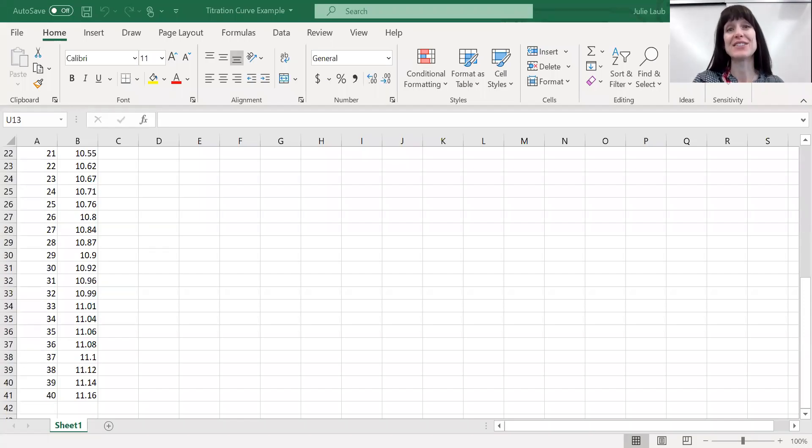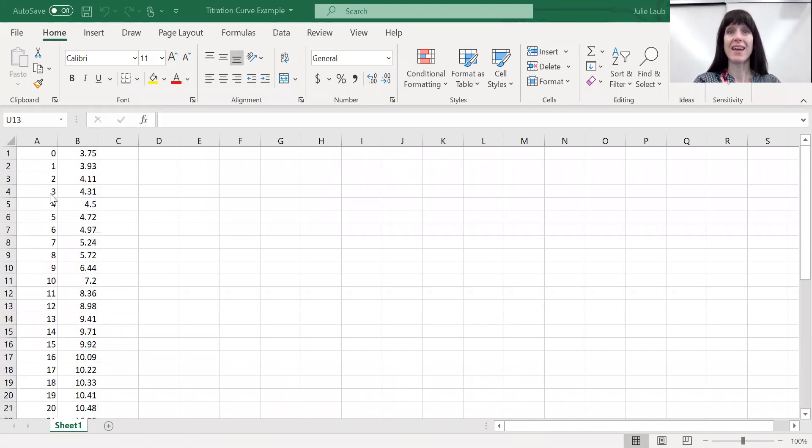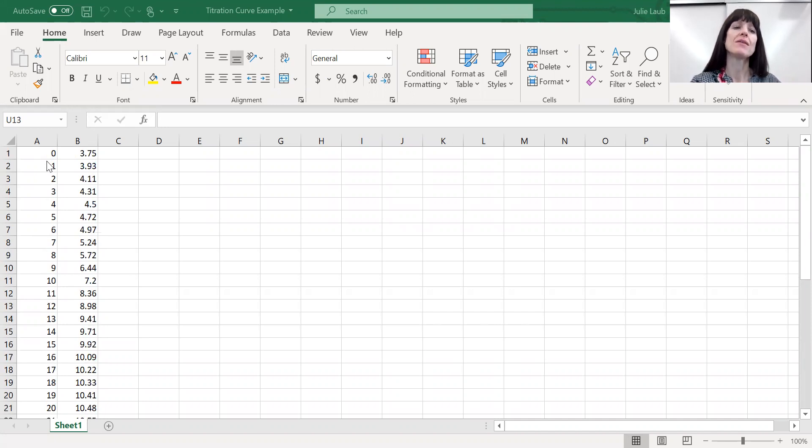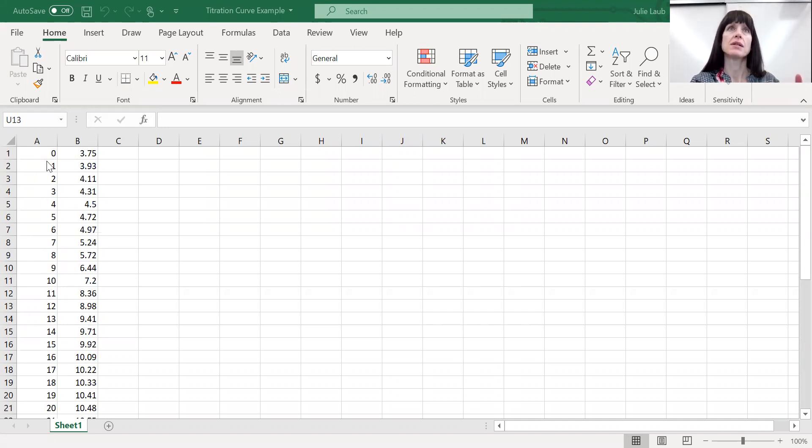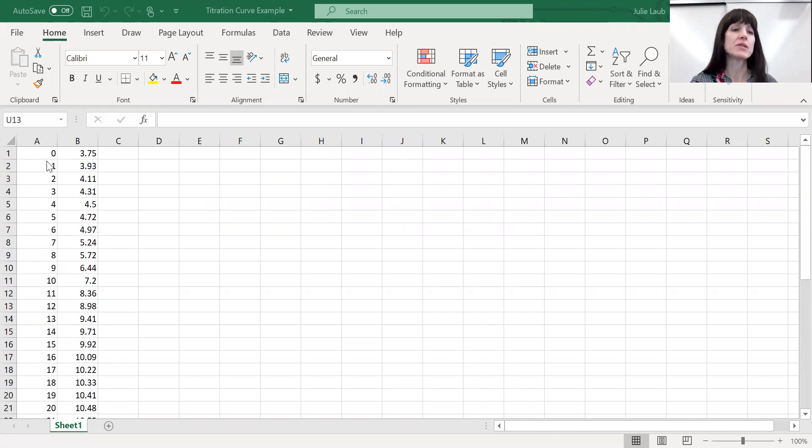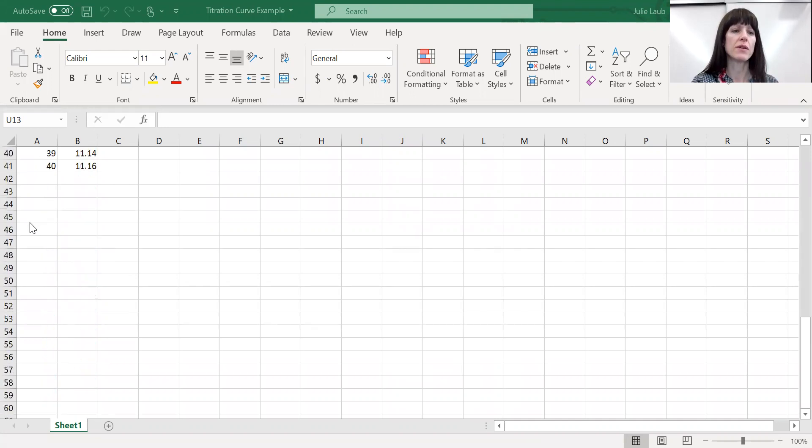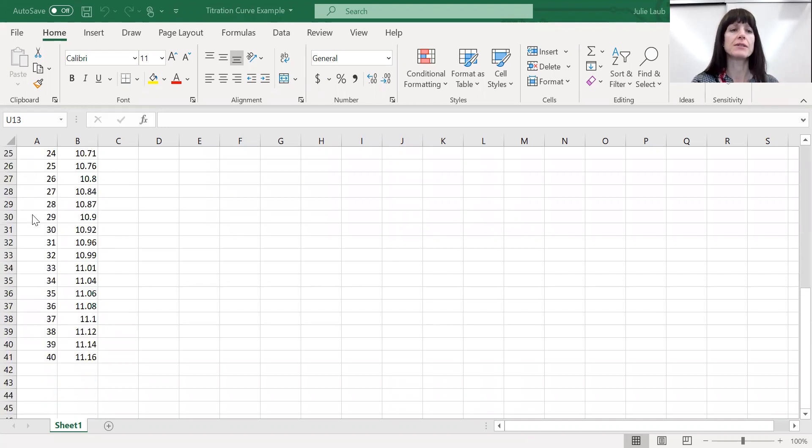Okay, first thing that you need is your data. Now notice in the A column, this is going to be the mils. It's going to be the amount of the titrant that you've delivered. In my case, this was a sodium hydroxide that we were titrating to find the amount of acid in some grape juice. And we just did it one mil at a time. Okay, so you can see one mil all the way through 40 mils.